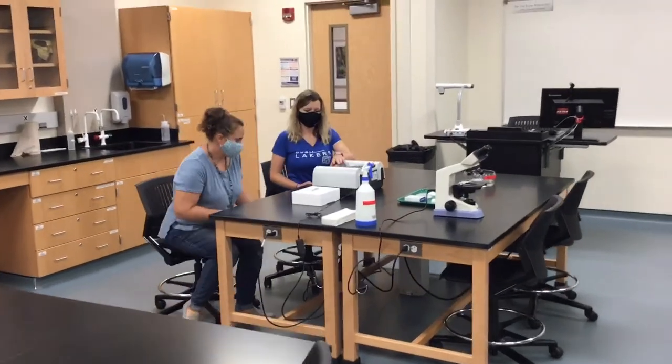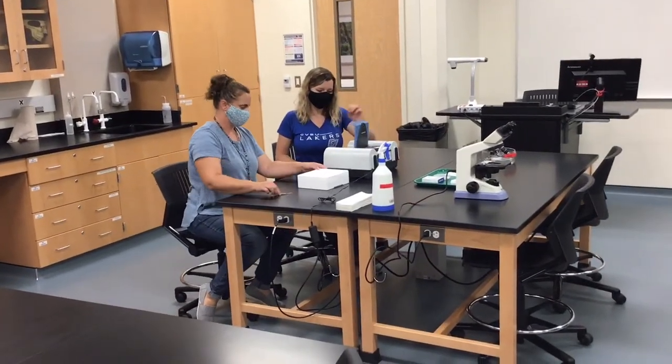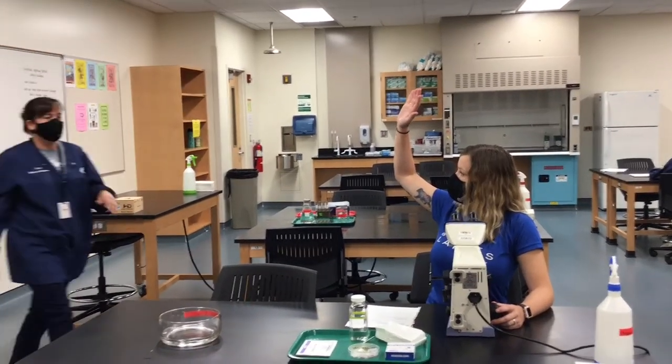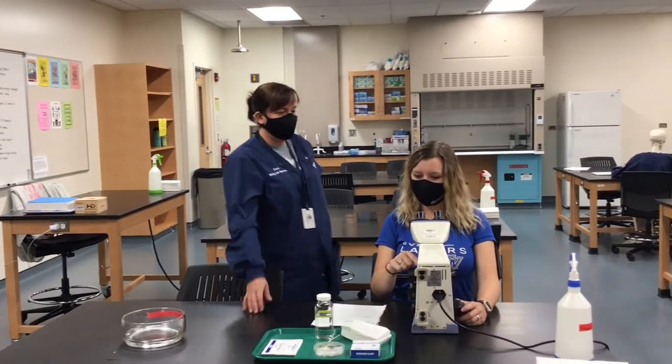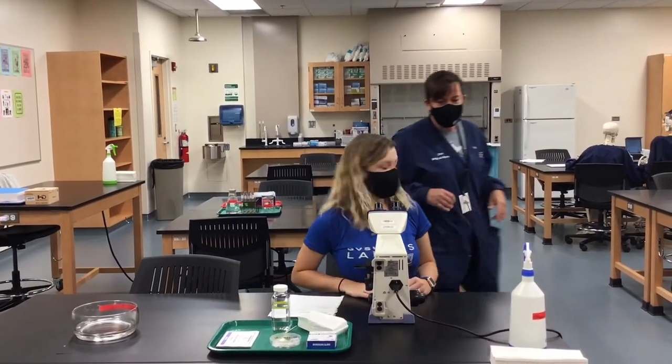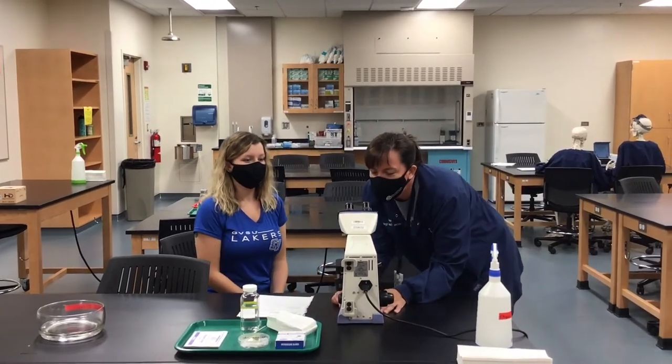As with all good lab practices, being prepared goes a long way. There may be other times in the lab where you have to be closer than six feet with other people than your partner, such as your professor. If this happens, just a reminder, keep your mask on to ensure that you're both kept safe.